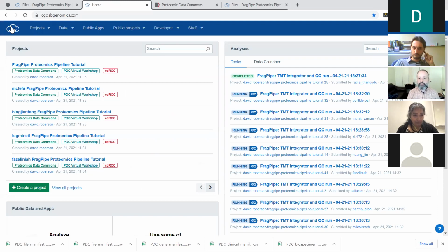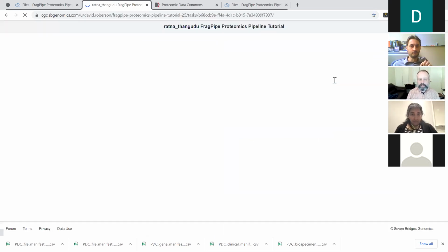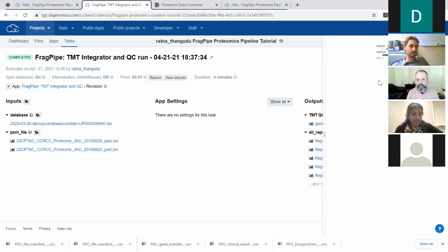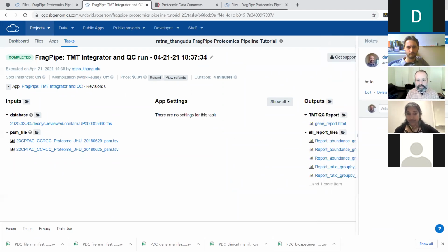I saw a TMT integrator completed. That's awesome. Feel free to go ahead and reach out to me in any of your projects. Just make a note, and you'll be able to see a conversation. We can have a conversation right in your project about any of your files. This was the first one that actually finished, so let me just look at that.